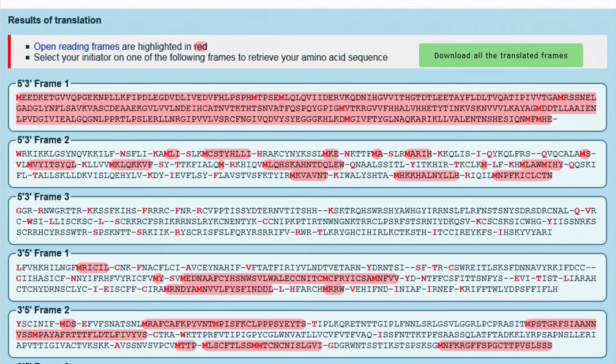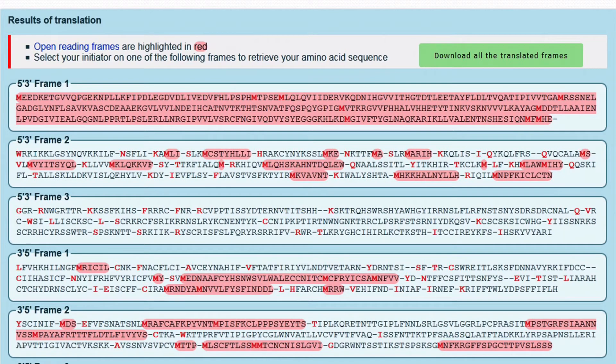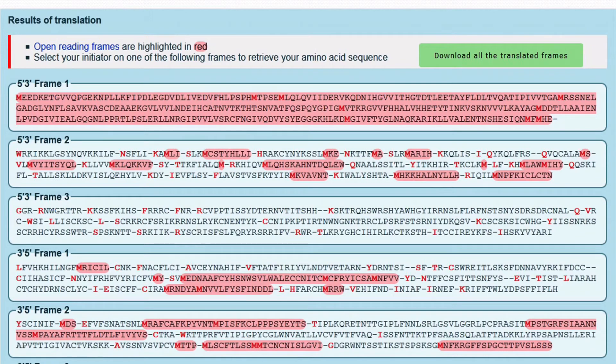The protein is now translated and you got the amino acid sequence. Starting from methionine, you got a continuous reading frame in 5' to 3' frame 1.